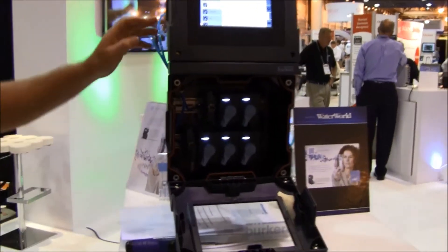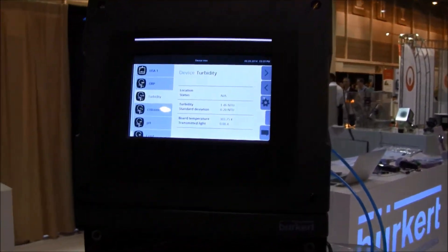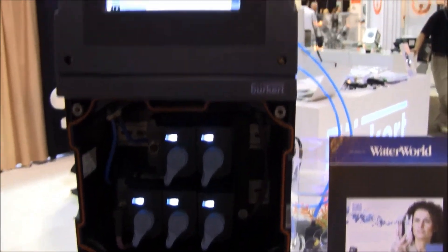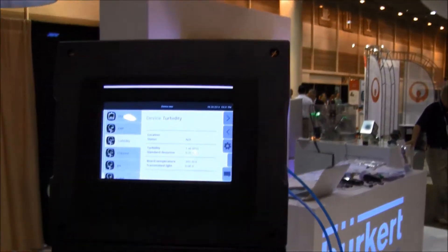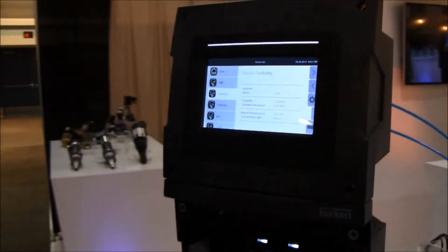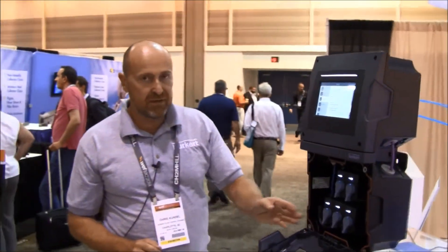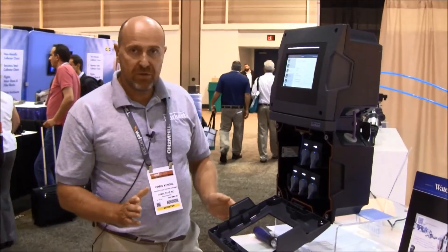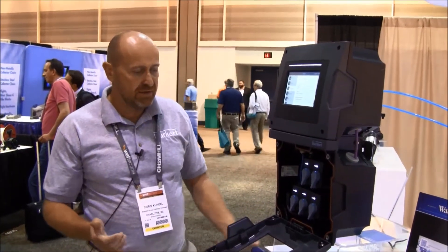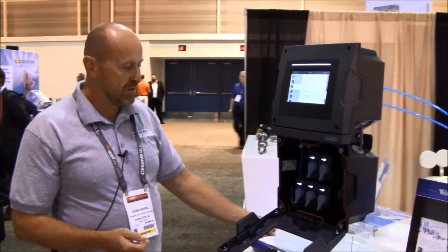Starting up the system is more or less just powering it up. Put on your 24 volt, 110 volt, or 230 volt power supply. The system starts up automatically — all the startup including detecting the sensors is done automatically. You just need to stand next to it and wait until it's done, which takes only a few seconds.